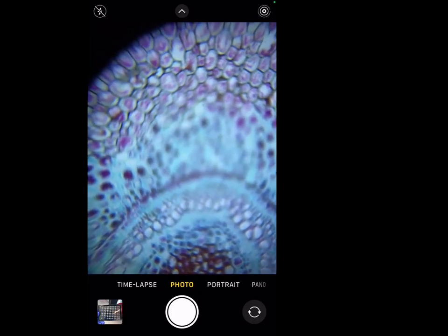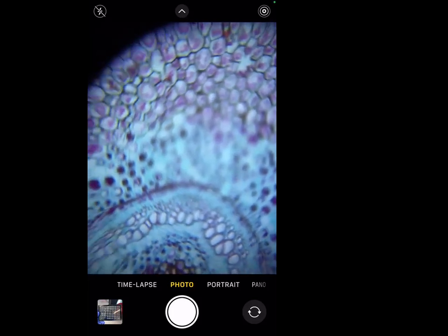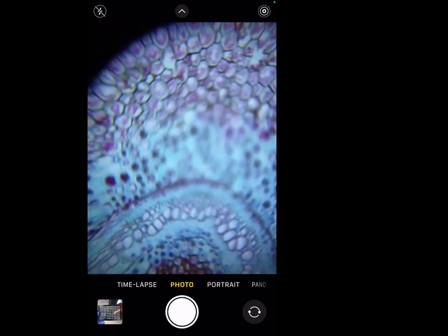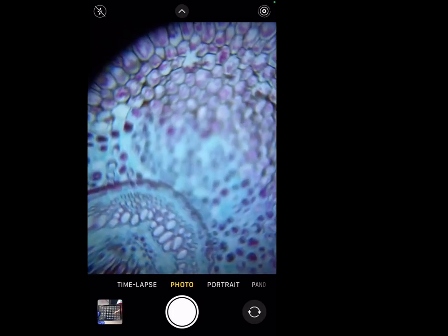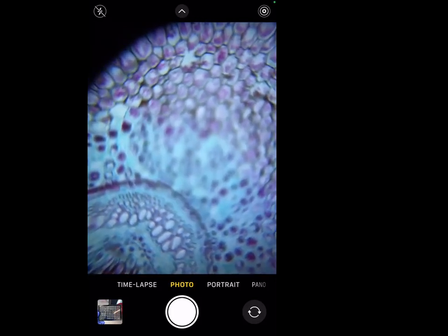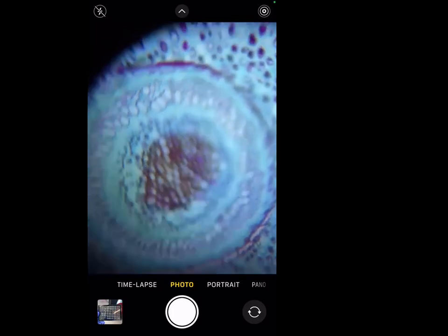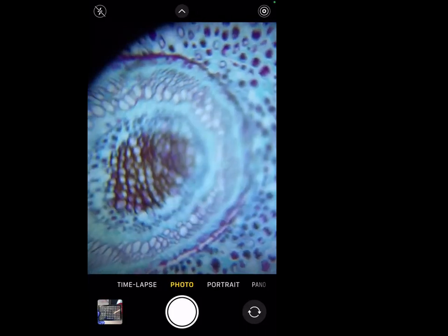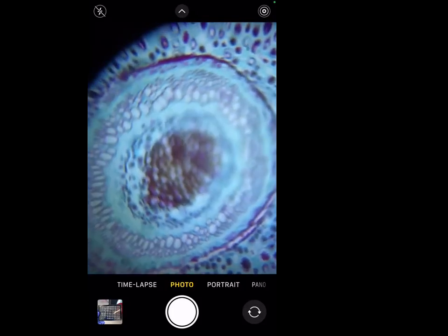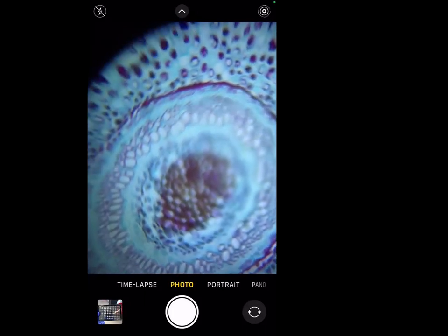So if you look at the other field of view or other camera, you can see that I hold the foldscope with my fingers, and with my thumb I gently move it. It becomes a little tough to move now that your phone is attached to the lens and everything gets heavy, but I'll try to bring it to the center. That's where I see a beautiful... Iqbal, can you refocus it? I still see the hazy spot. Yeah. I'll refocus. So I'm trying to bring it to the center, and then I'll show you what the cells at the center of the stem look like.